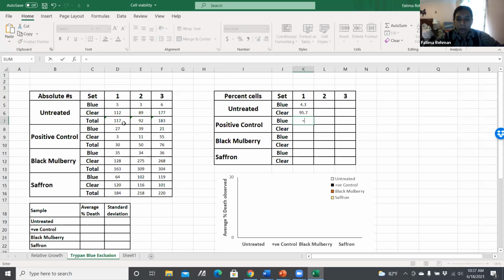So you guys can go along with me if you're at that stage where you can go ahead and do that. Even if you're not at that stage, you can take your completely empty tables once they're copy pasted, and you can do all these formulas in there. And when you populate your numbers, it will populate your calculations automatically. And many times that's what I have, things that are already partially formatted.